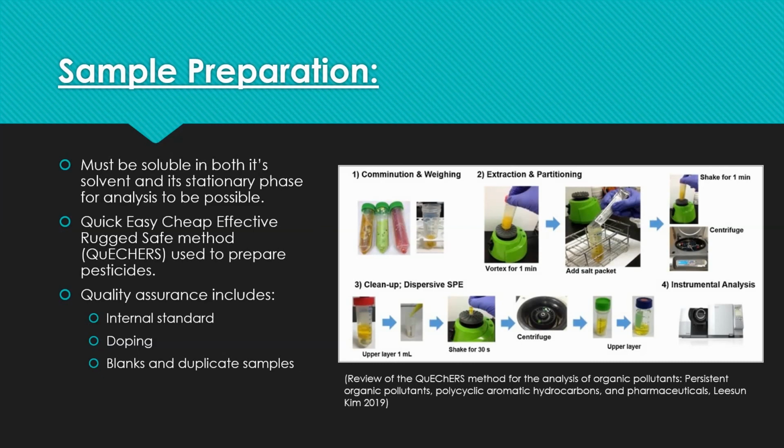An example of an alternative sample preparation method is the preparation of pesticide samples using the quick, easy, cheap, effective, rugged, safe method, or QuEChERS. The pesticide sample is homogenized and undergoes a liquid-liquid extraction between acetonitrile and a water-magnesium sulfate mixture. The sample then undergoes a solid phase extraction where a lot of the unwanted compounds are removed from the matrix. The sample is then micro-injected at a volume dependent on the diameter of the solid phase column. This method increases the extraction efficiency of the pesticide sample.